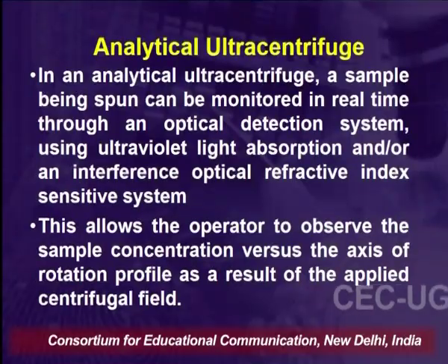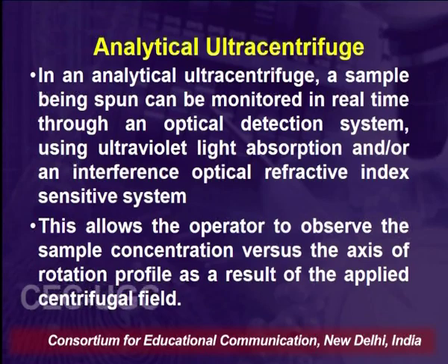Basically, this type of analytical centrifuge can be used in certain cases where we are doing novel research, where we want to know the sedimentation behavior of different particles, how they are behaving with the applied centrifugal field. Then we have to look for certain different particle sizes or different substances.